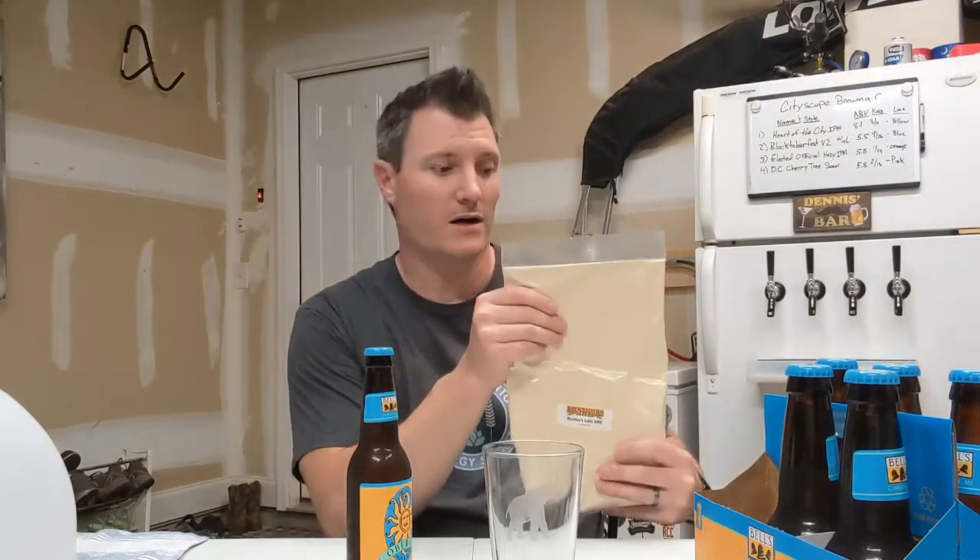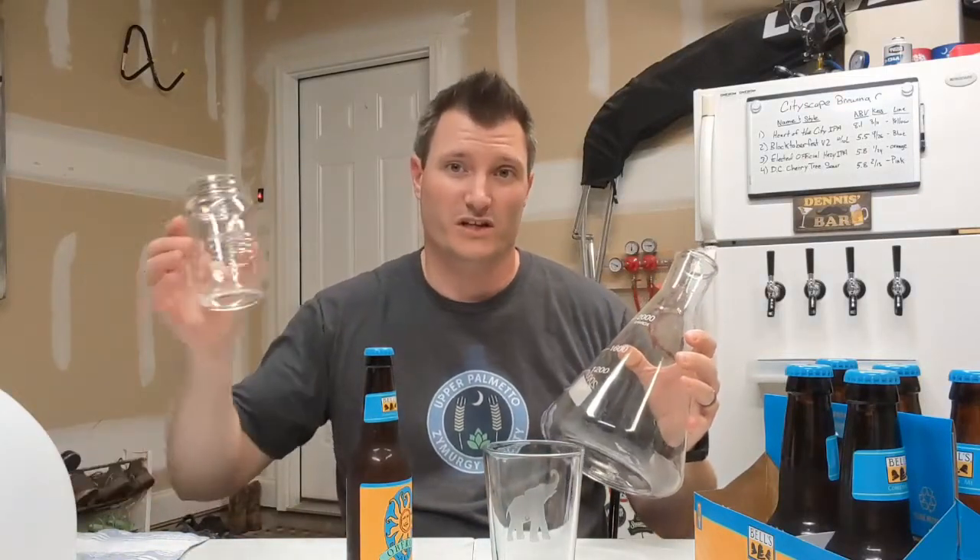I'm going to create a starter using fast pitch wort — there are also proper starters using DME, dry malt extract, which you can do to make a regular wort starter, and there are plenty of videos online showing that. For a one-liter starter you'd use a flask like this. We're starting small because we have such a small amount of yeast — we'll put a few bottles' worth into this mason jar and then in a couple of days we'll make a one-liter starter out of this.